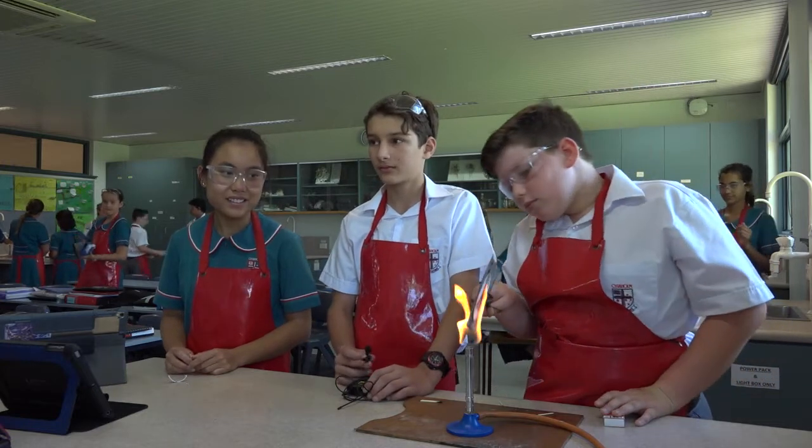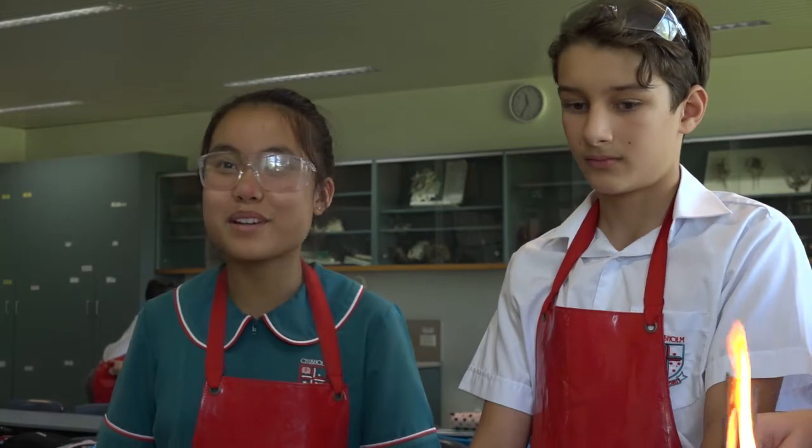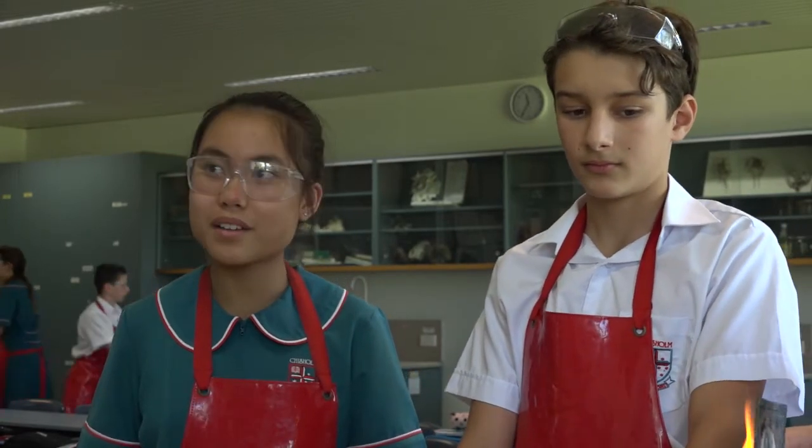So, Mary, can you tell me what you are doing at the moment in science? Today, we are learning how to use a Bunsen burner and learn about the different parts of it. Fantastic. And, Jack, what experiment are you doing? Right now, we're testing the hot and cold air using a gauze mat.